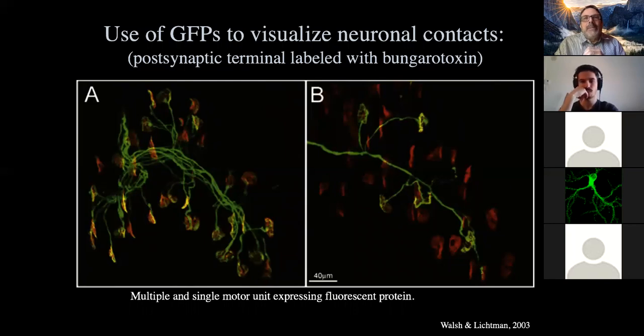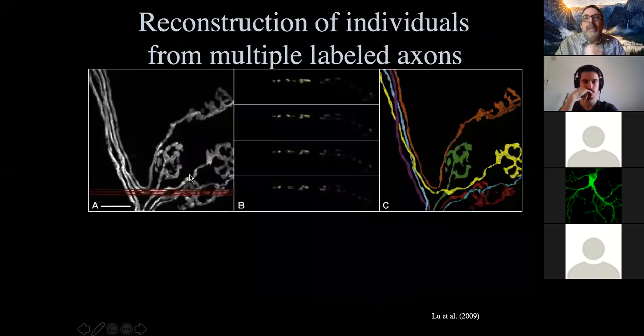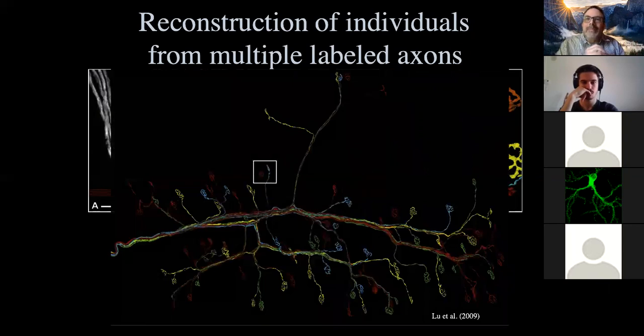The challenge, though, is that if you want to study this process developmentally and what changes over time, you really need to be able to reconstruct single axons. So in this case, you can sometimes pull out a single expressing motor unit, but it's more useful if you can get multiple motor units in the same prep. And at this level of resolution, it's really easy to do segmentation of the images and digitally separate out the individual axons that project to the different motor units and generate these kinds of beautiful reconstructions of complex inputs to the periphery. So this is the kind of work that allows us to come up with a wiring diagram, but obviously in the peripheral nervous system, it's much, much easier because of the scale and the fact that the axons aren't so densely packed together.